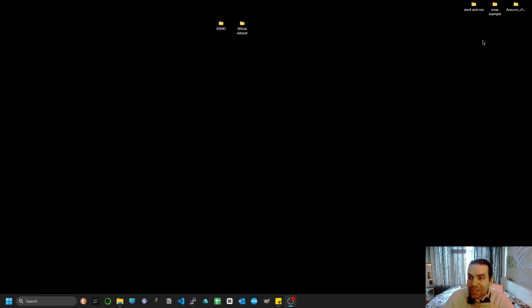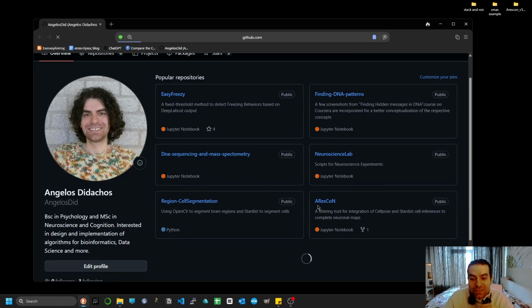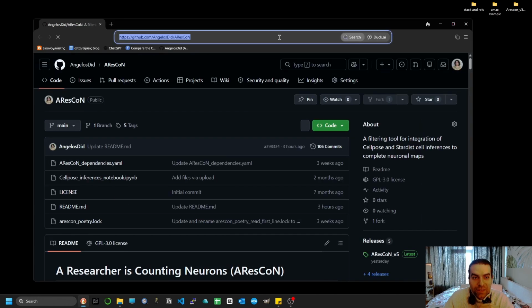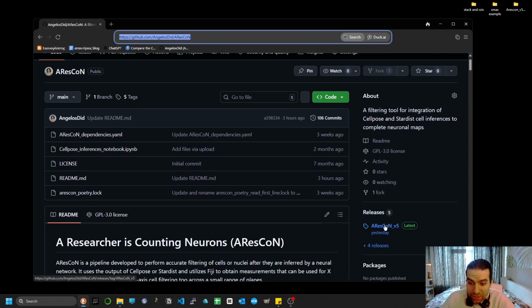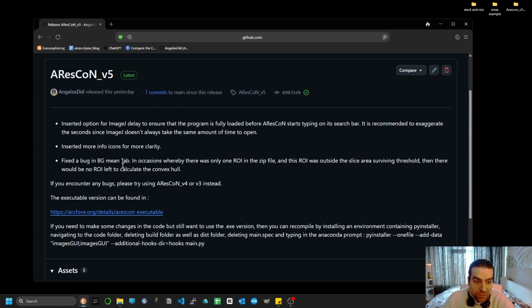All right. So, without further ado, let's open Arescon and see where you can find it. Let's go to my GitHub page, and you can find Arescon on this link. It's always recommended to check the releases and download the latest release. Right now it's version 5.